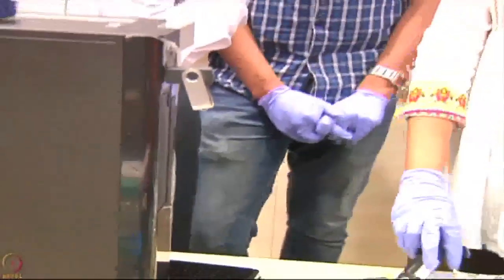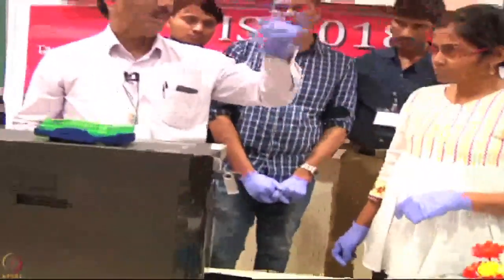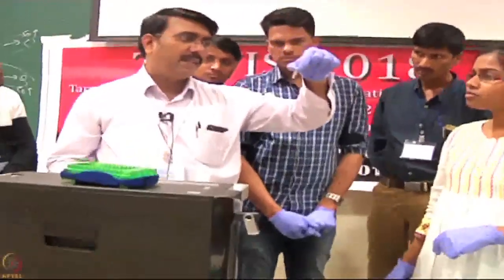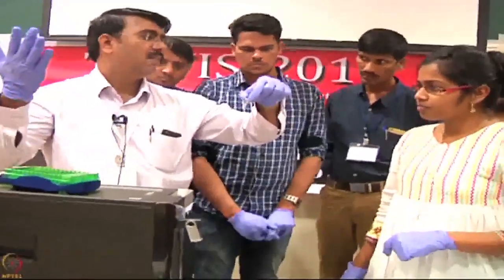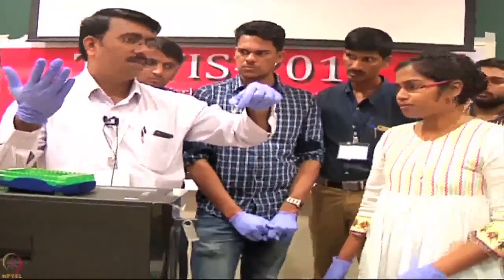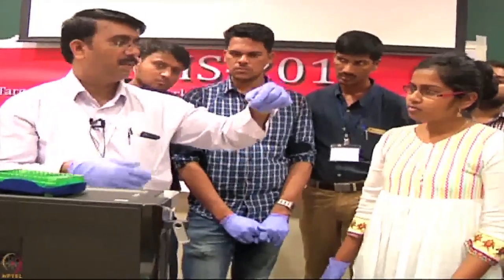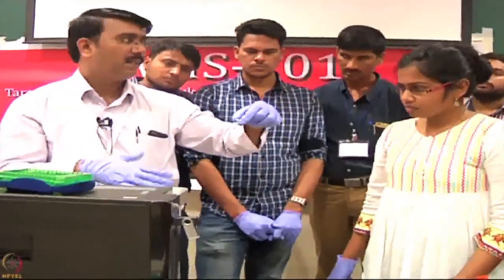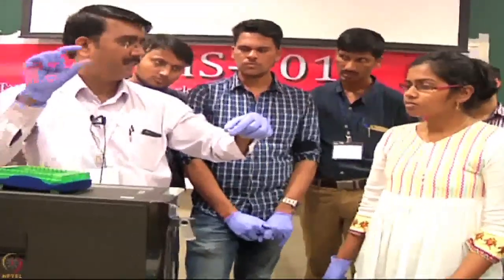Now we have to make the binding partner, the mouse monoclonal antibody. This is exactly 1 mg per ml. I have 20 microliter here. Take 10 microliter or 5 microliter and transfer to the corresponding 1 ml or 500 microliter. So I take 5 microliter and put it into 500 microliter. It corresponds to your 10 microgram per ml concentration.